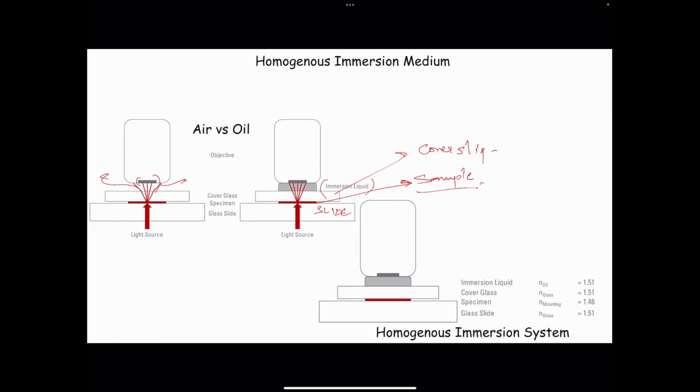Each of these has a wide variety of preparation methods. They can be prepared by mounting, they can be done live, they can be prepared by different kinds of mounting media, and all of these things are different. We can already appreciate, if you have studied basic biology in 10th standard, how animal, plant and bacterial cell components also differ a lot at a fundamental molecular level. All of these preparation methods will depend upon how your sample is, and if your sample is so diverse, your preparation method would also be diverse, which includes whole mount, slice, culture, etc.